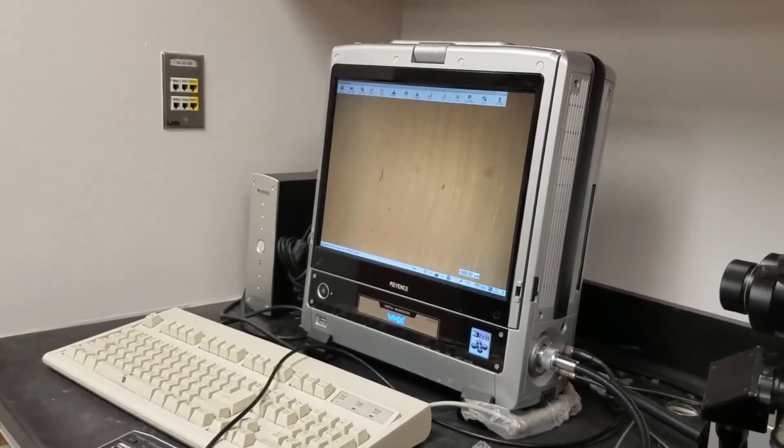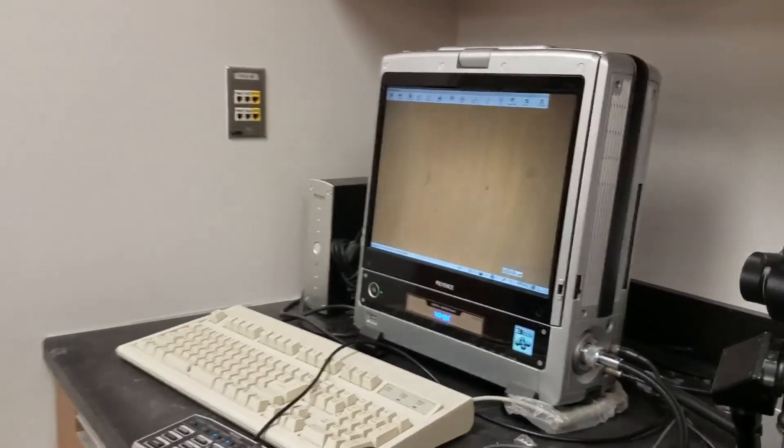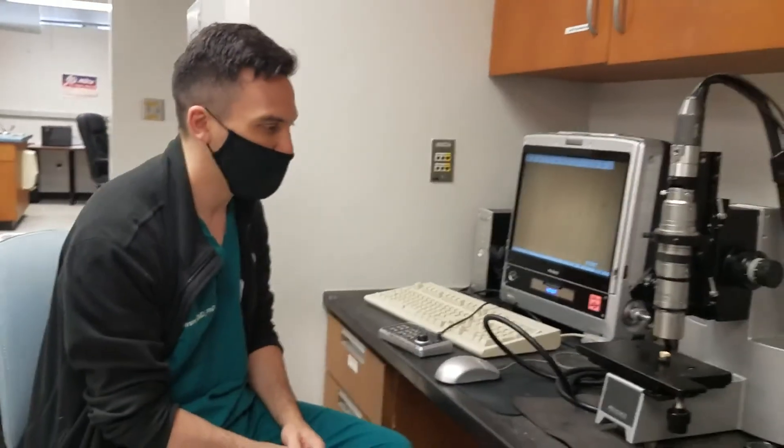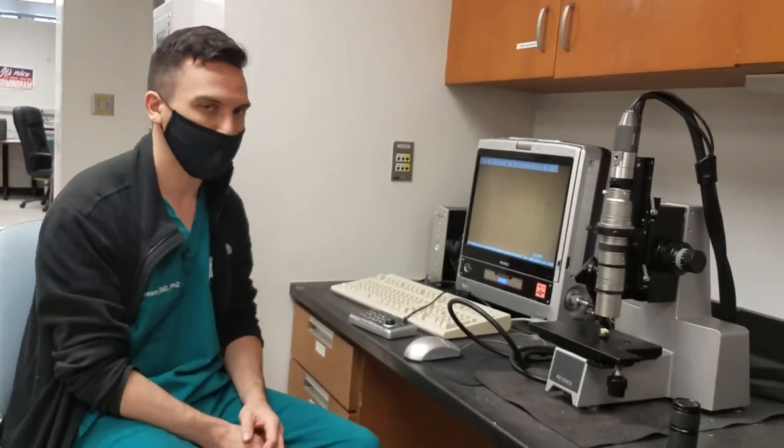So that's a little introduction to the Keyence microscope.